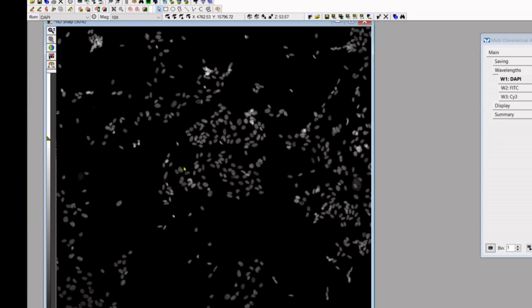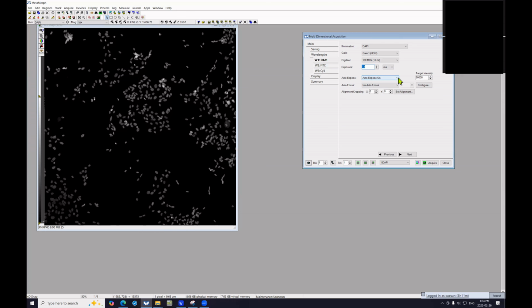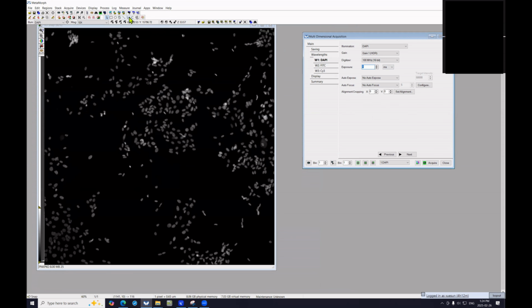It is important to check the numbers as this camera is very sensitive and you might not be able to judge the dynamic range properly by only looking at it. For example, if you reduced the exposure time to 1 millisecond, qualitatively your picture wouldn't change. However, the dynamic range, and thus your signal-to-noise ratio, is much lower now. This will be a particular issue when quantifying your signal during analysis.